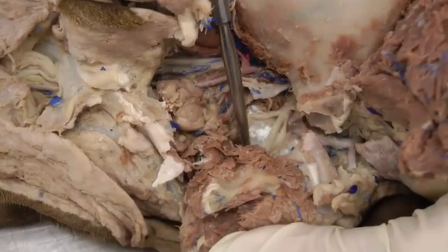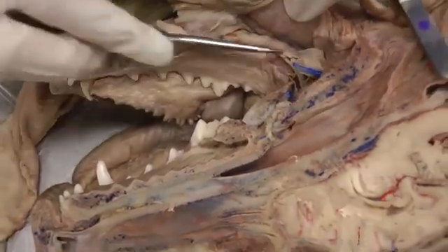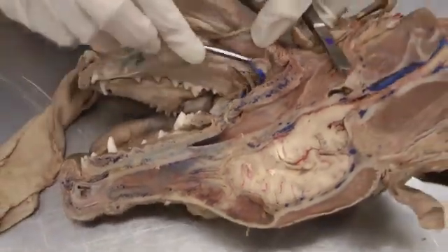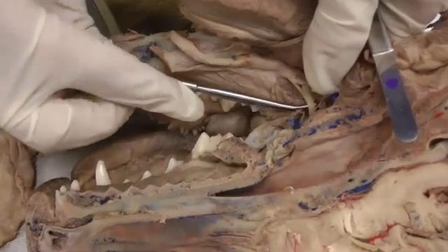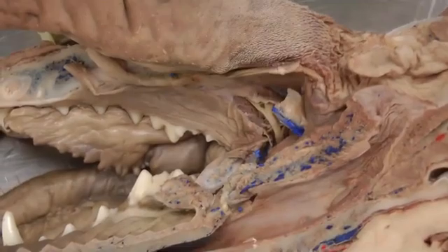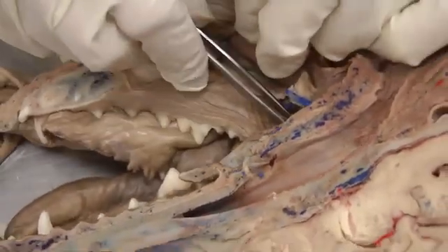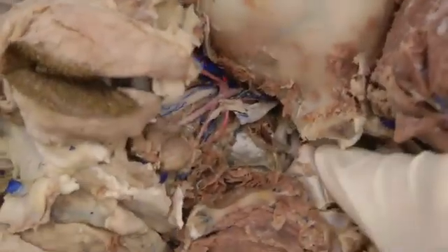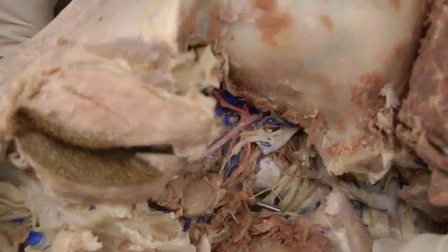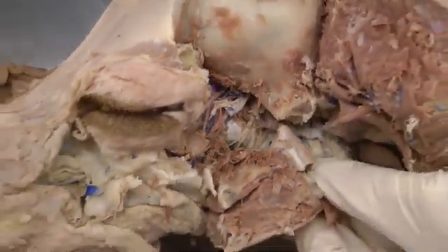The lingual nerve, if you want to trace it, goes down to the tongue as the name implies. In this ventral view with the tongue pulled out of the mouth, here coming down is that lingual nerve. If I put the forceps around it and backtrack, you can see it coming right out and pulling on that lingual nerve — going actually to the tongue.